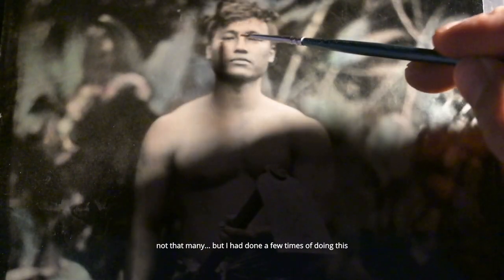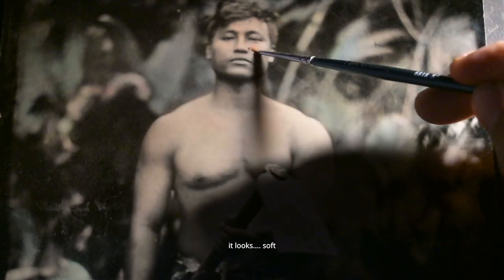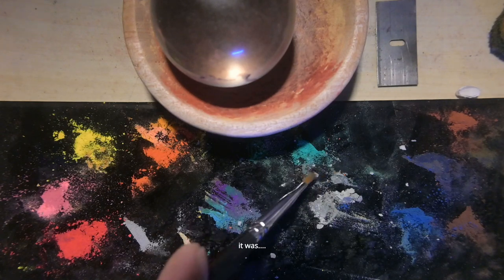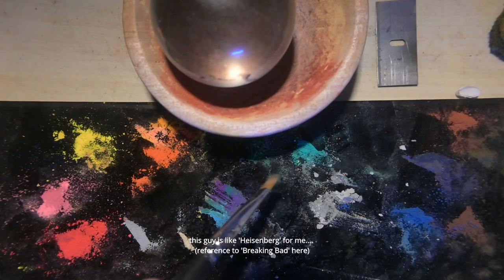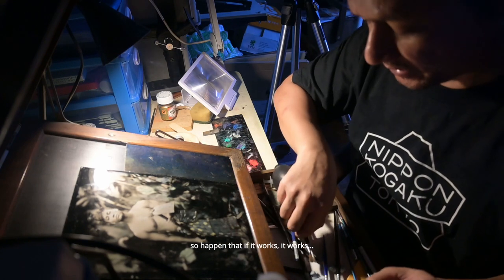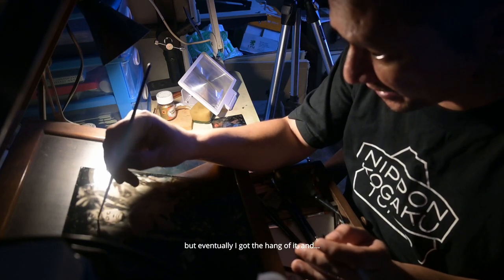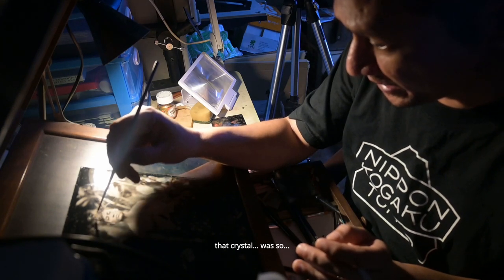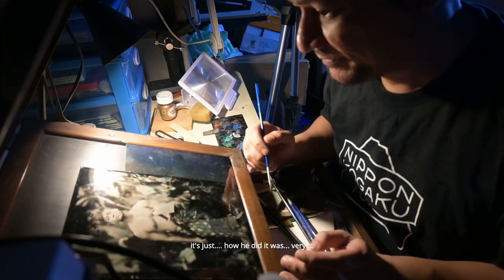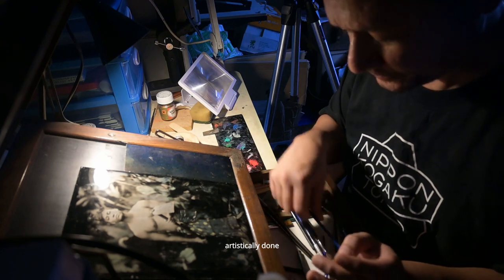I mean, I've done this a few times before and it always ended up as regular crystals. But what he did looked soft, silky. I had a moment and I thought, wow, this guy's like a Heisenberg to me. So I spent another two weeks trying to learn that method. It's not easy — it so happened that if it works, it works; if it doesn't, it doesn't. I tried to repeat his method, but eventually I got the hang of it. Silver nitrate is very easy to dilute in water solution, but it's just how he did it — it was very artistically and nicely done.